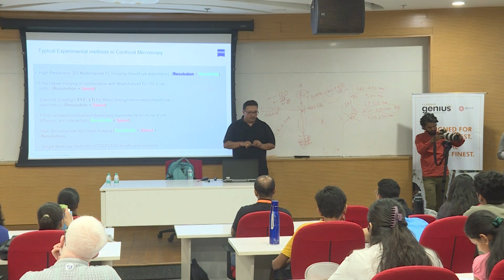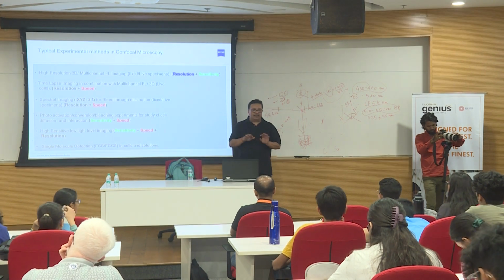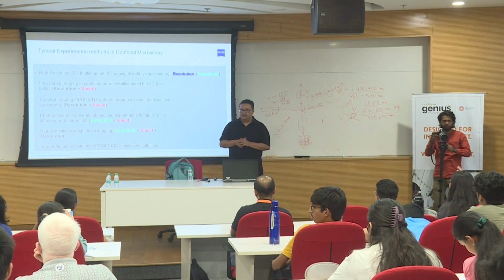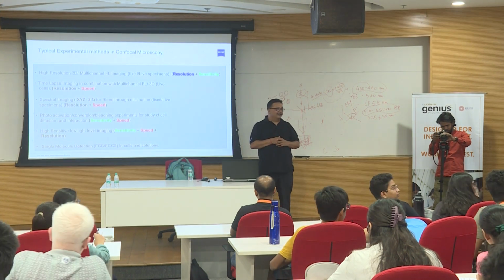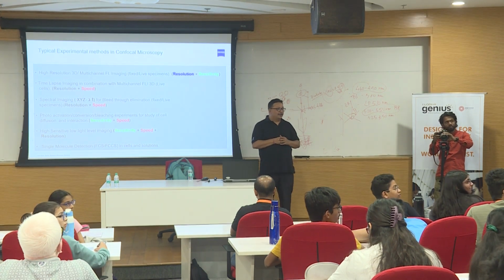So if you have an image, and my image is an 8-bit image, you know 8-bit, 10-bit, 12-bit? Anybody interested in imaging over here? Camera-based imaging, photography? You understand an 8-bit image?